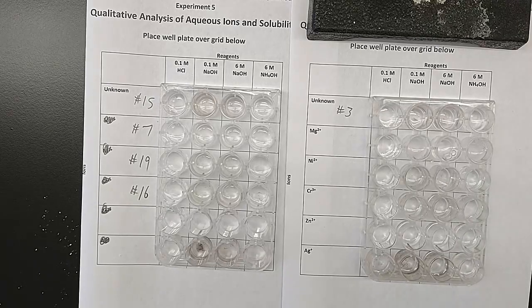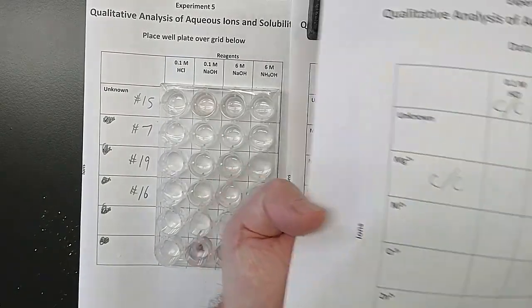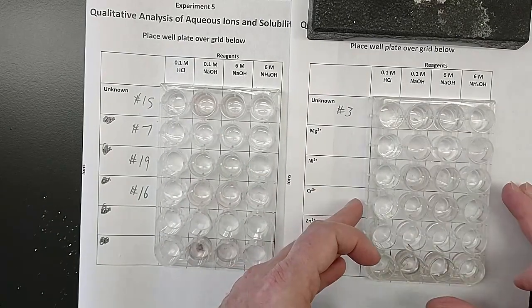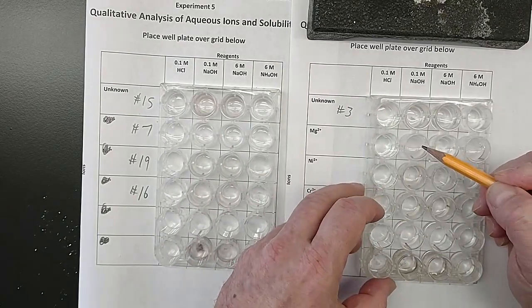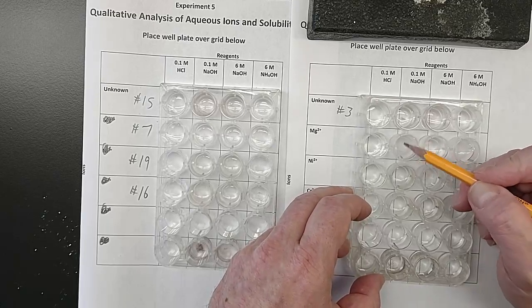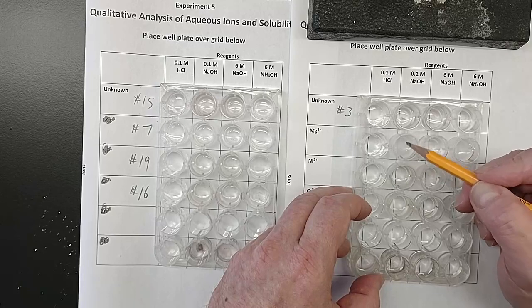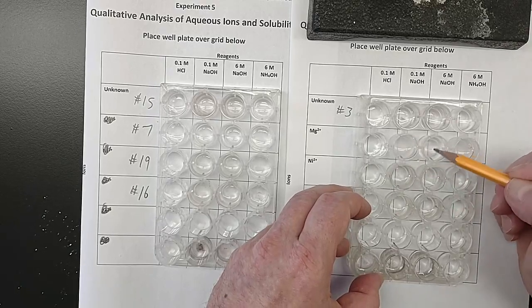Now, the magnesium was clear and colorless when I started, but if you look, in the NaOH one, the dilute one, if I move it over the line, you can't really see the line there anymore because this is cloudy and white. The 6 molar sodium hydroxide also, it's a little cloudy and white.